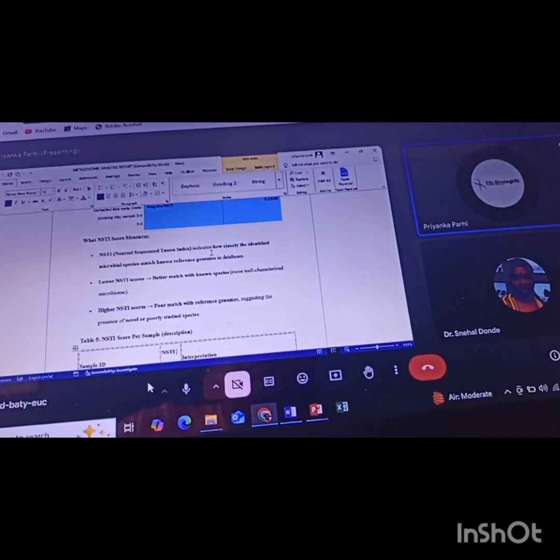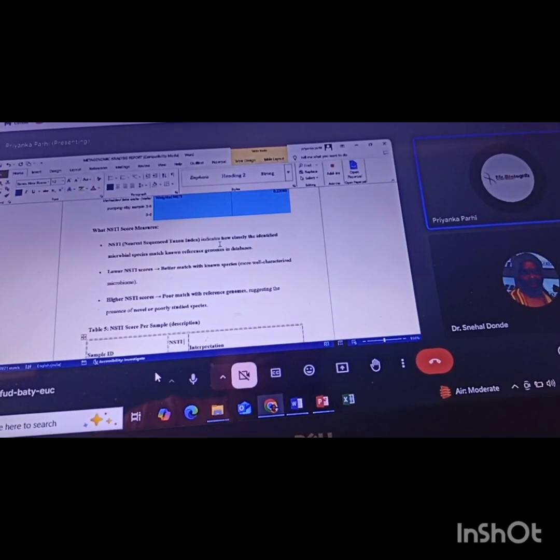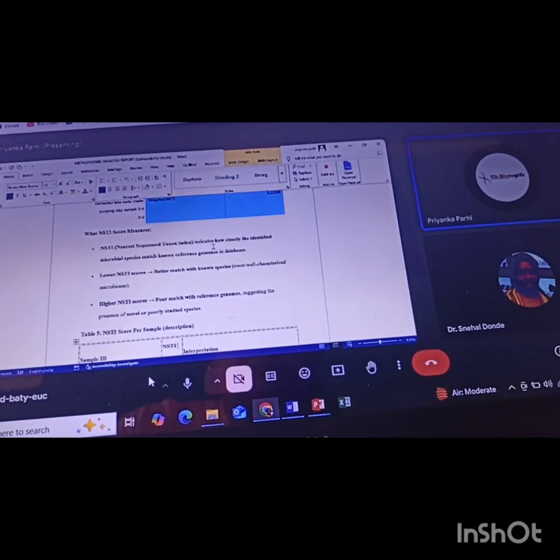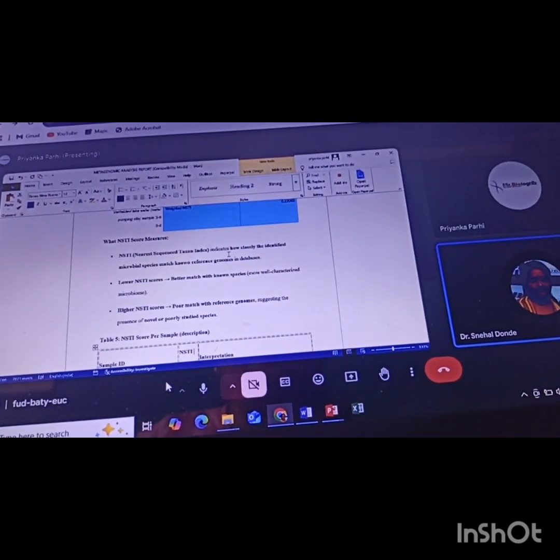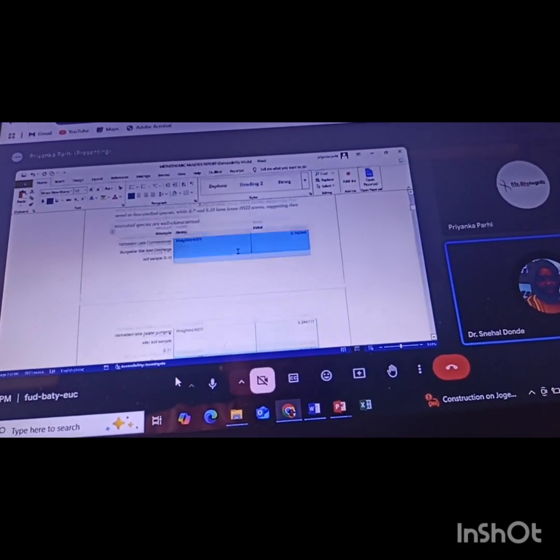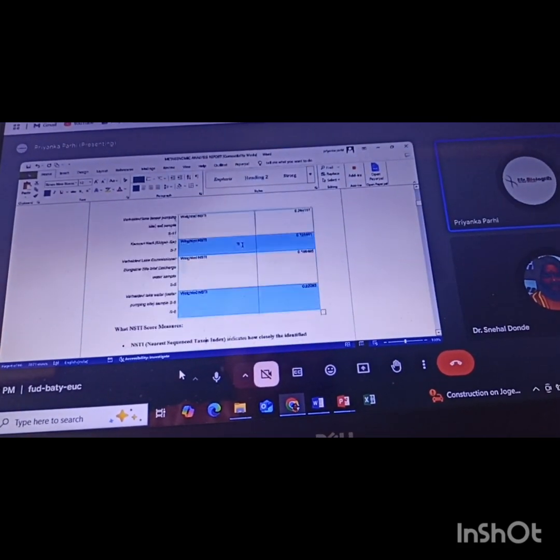We can accumulate them and then generate a cumulative microbial profile, or we pick a location like the north of the lake. It might not be very stable because the water moves, but it still gives the overall idea of what the microbiome profile might be in that particular zone. Looking at the data, I can see 0.22, and above that 0.142. How do I interpret that? Let me go to the values.